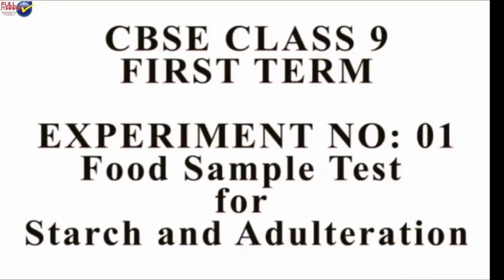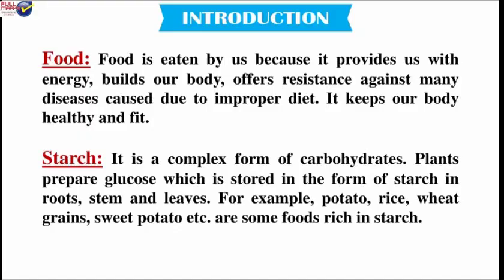CBSE Class 9 First Term Experiment Number 1: Food Sample Test for Starch and Adulteration. Introduction: Food is eaten by us because it provides us with energy, builds our body, and offers resistance against many diseases caused due to improper diet.